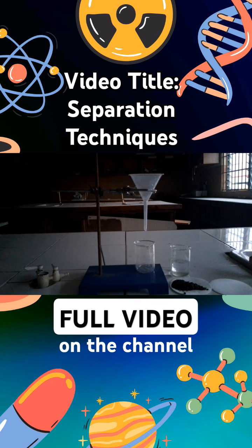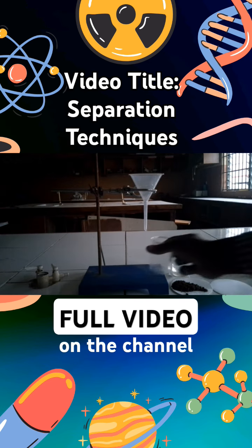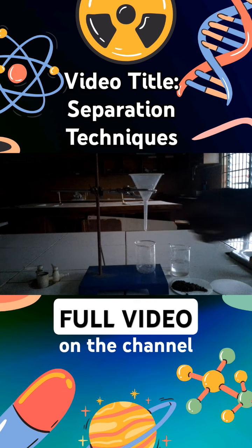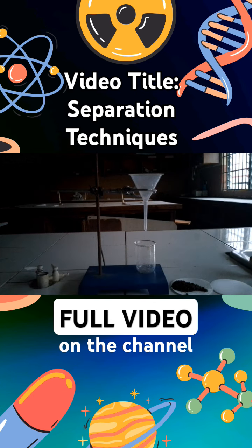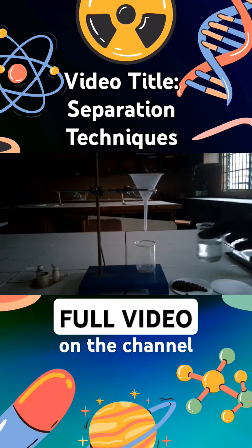Now, what are we separating? We have a sand sample here, a soil sample. We have an empty filter paper here that has nothing on it. We have a beaker, an empty beaker. There's nothing inside, as you can see. We have a funnel here. We have a retort stand here. And we have a water sample here. This is pure water. Nothing has mixed with it. This is pure distilled water.